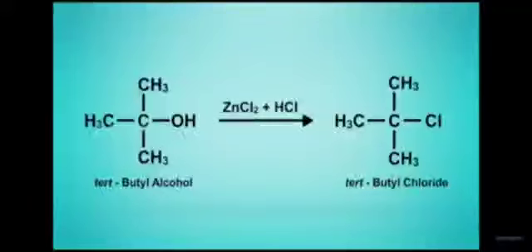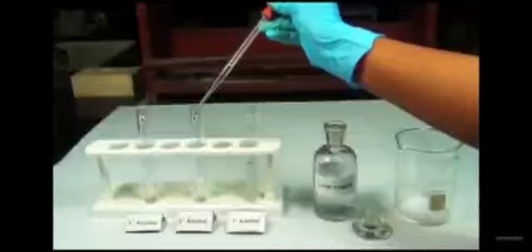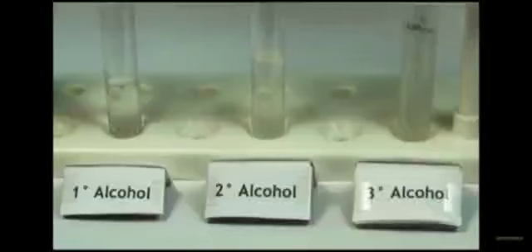If cloudiness appears immediately, it means tertiary alcohol. If cloudiness appears within 5 minutes, secondary alcohol is indicated. And if the cloudiness appears only upon heating, primary alcohol is indicated.